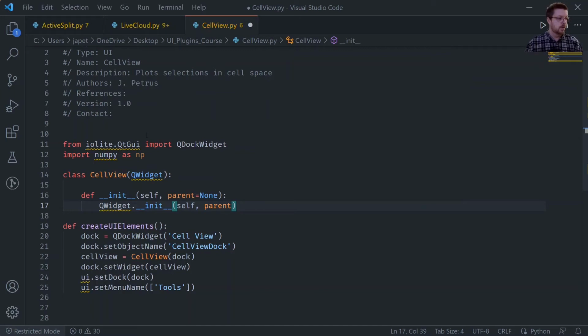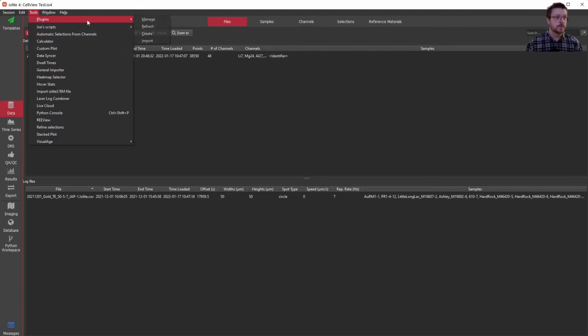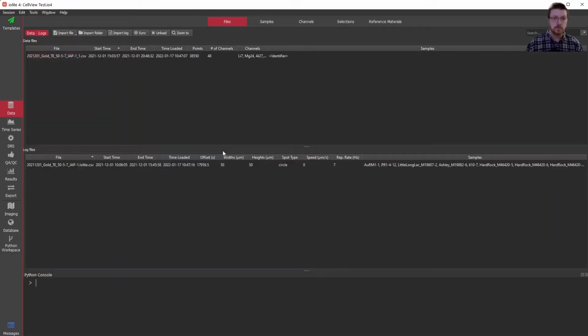Okay, so let's just save that and make sure that that is working. So it isn't.